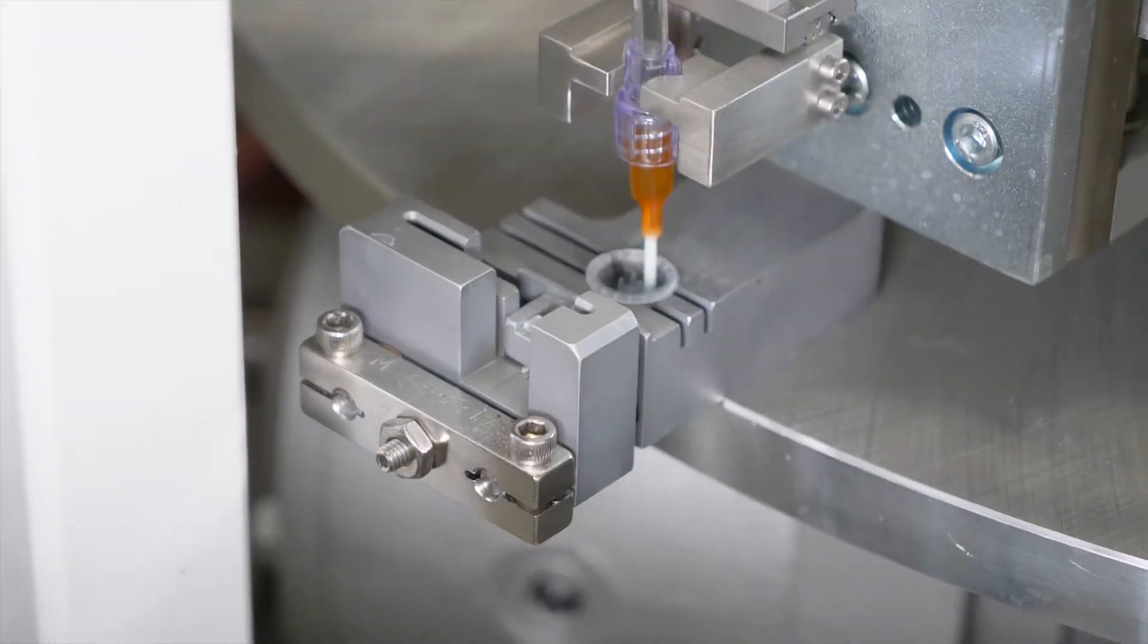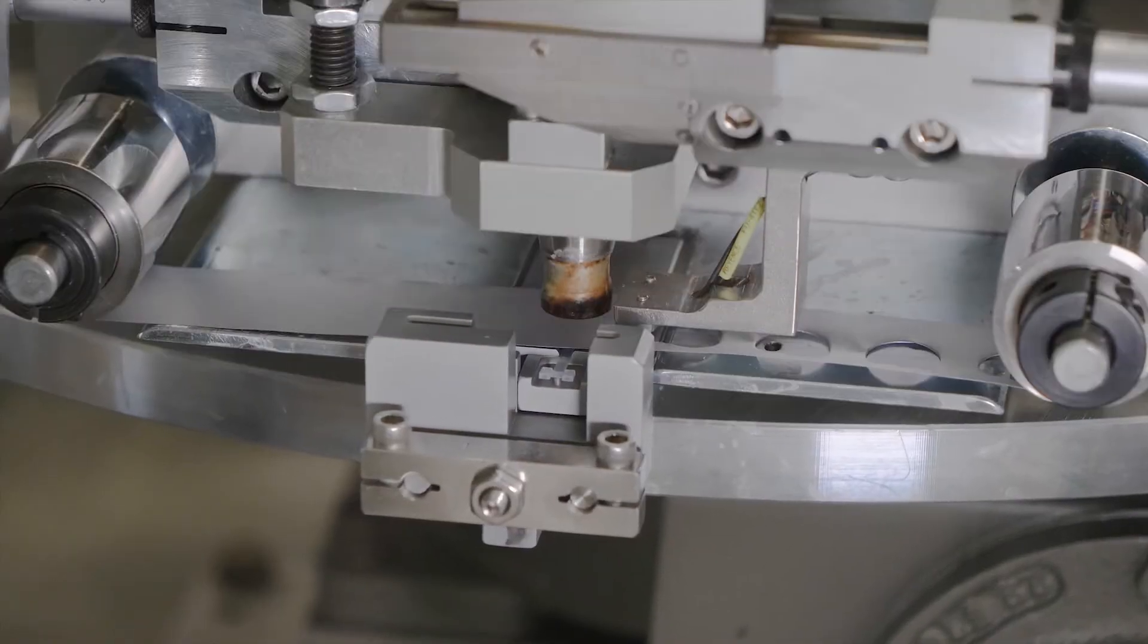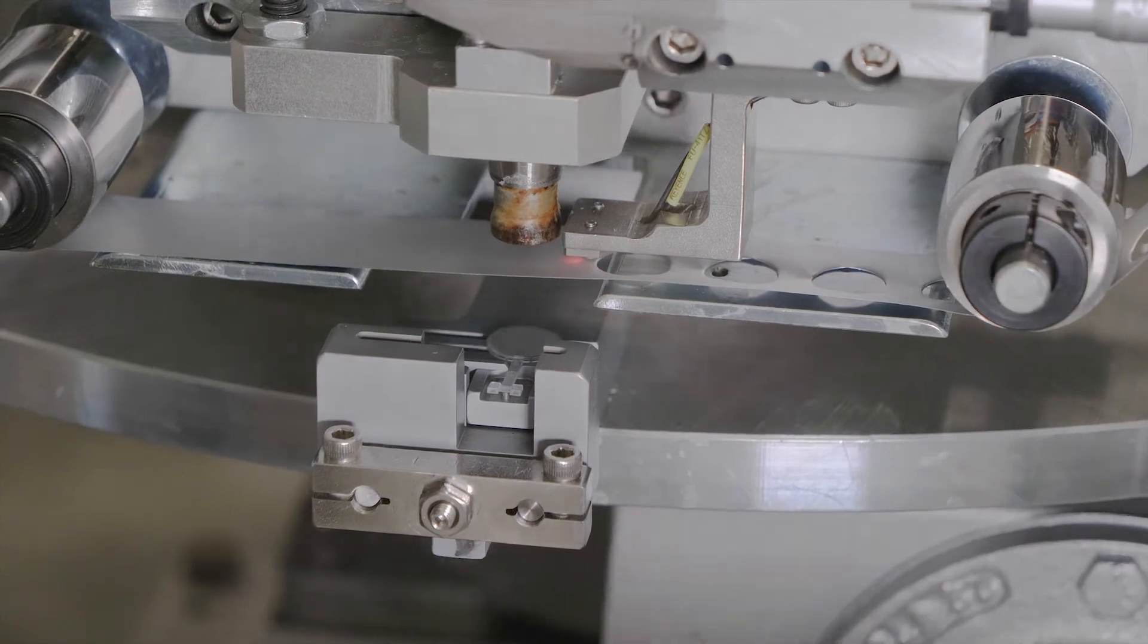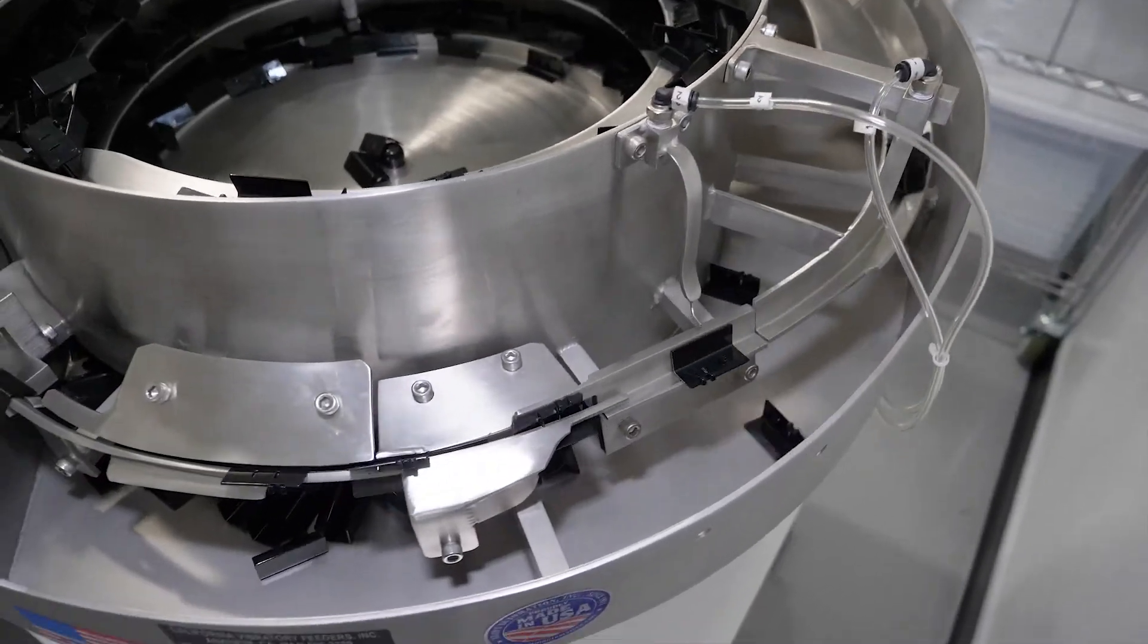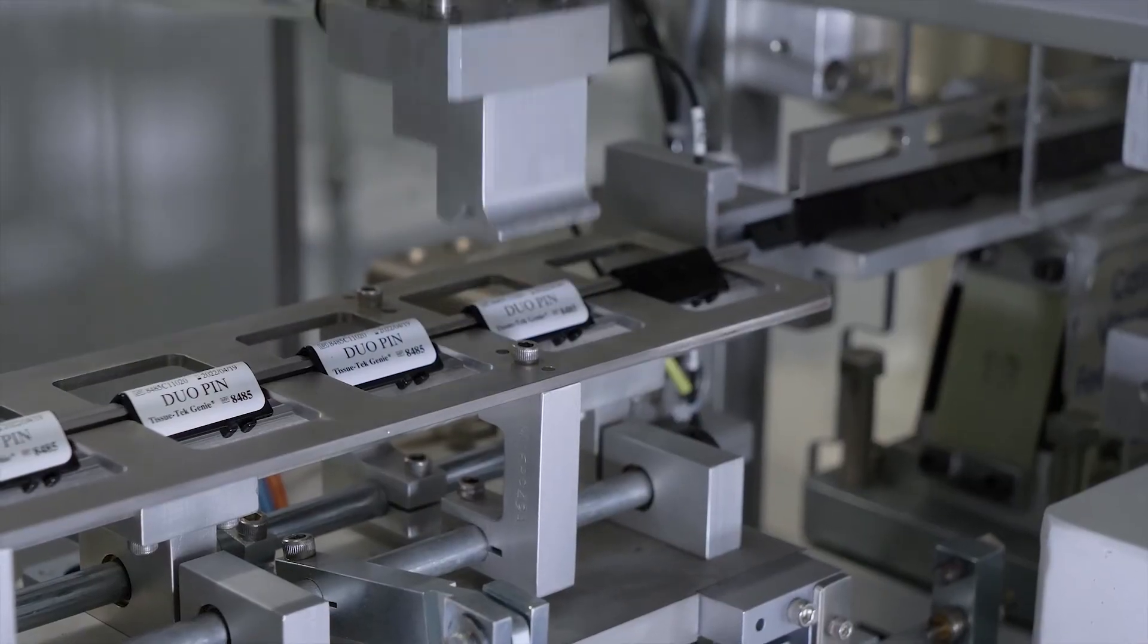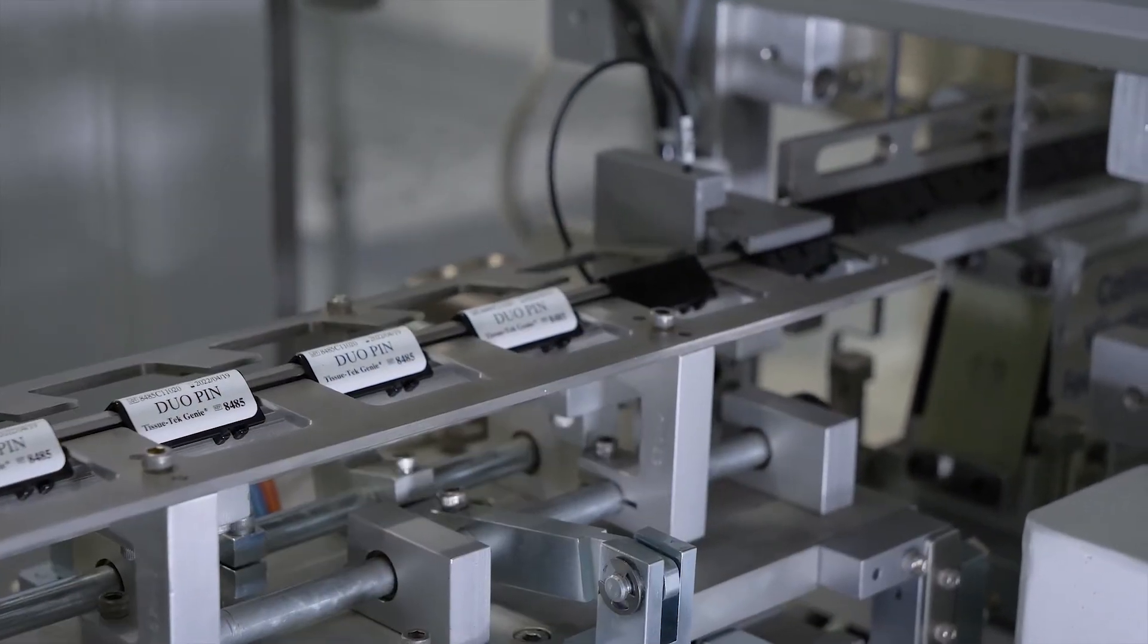The capsules are filled with a precise volume of reagent. Capsules are foil sealed perfectly to release the reagent when needed. Set up for one capsule product, labels are printed and affixed to the capsule tag.